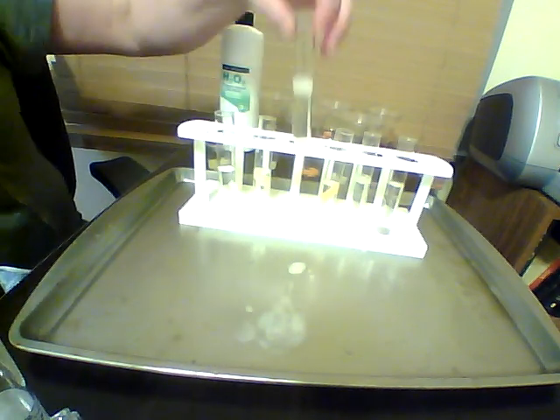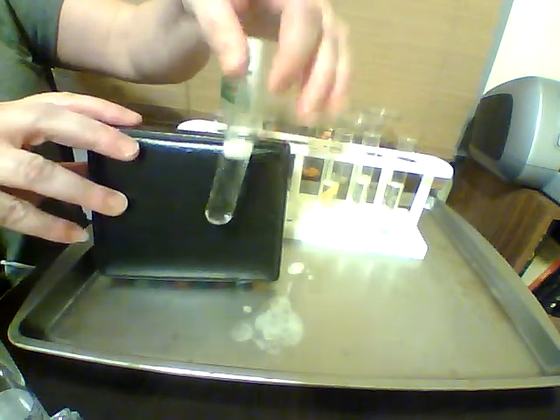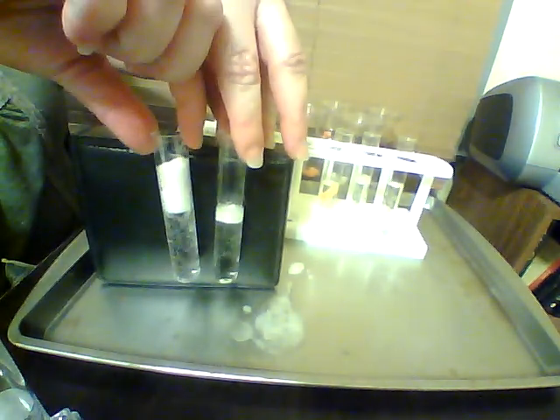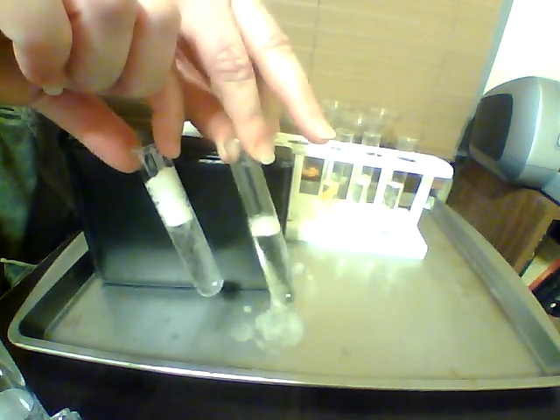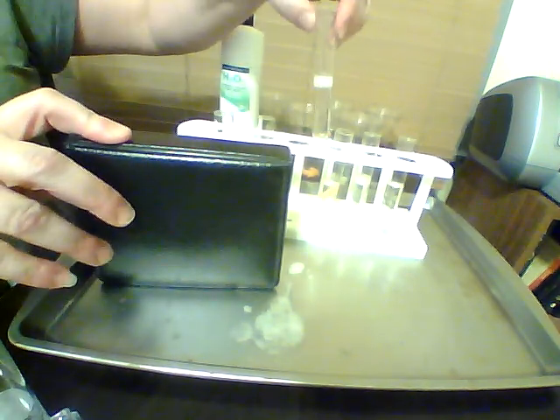All right, so let's compare our banana. So we've got our cooked banana compared to our raw banana. So you can see there's still some reaction, there's still some going on. If I cook them longer, probably wouldn't be anything.